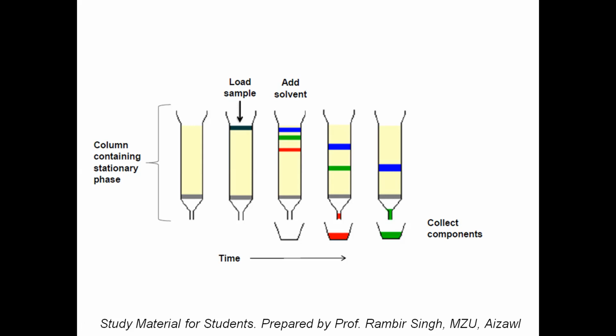So this concept is called strength of the mobile phase, or elution strength. You can write it down: elution strength.